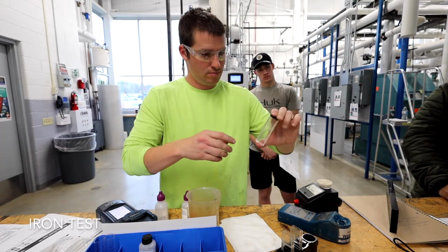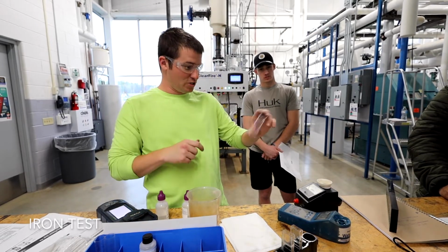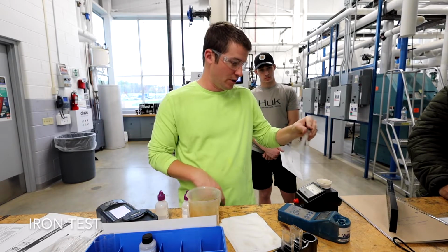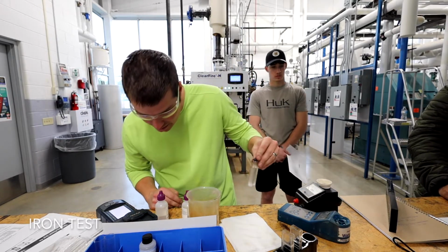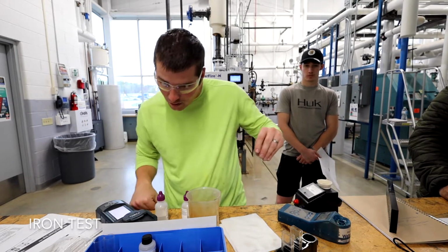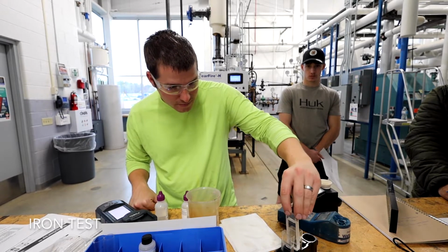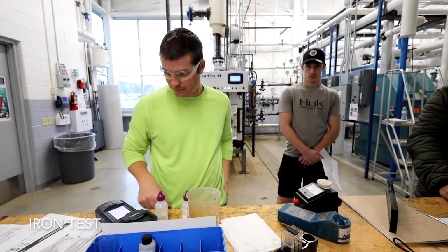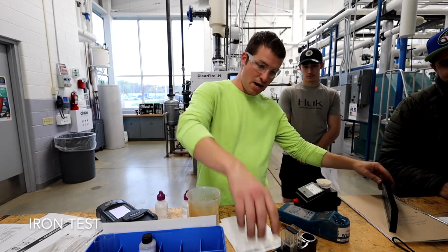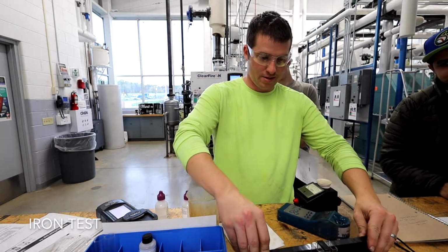So that goes to our orange too then, right? Is this the iron? That one's going to turn purple actually, but it should turn a color. Again, it's saying not to wait at all, which is interesting. You didn't wait 3 minutes, so we'll give it a minute. I have 0.56 again on mine. Okay, so you're going to put this in there like that.